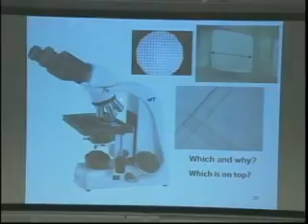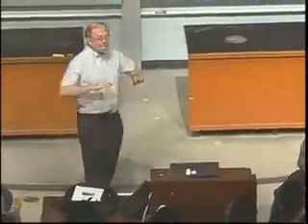What you can't change is the focal point of those lenses. The focal point of those lenses is fixed because this lens is always going to be that length from there, right? So the focal point of the lenses is always fixed. So how do you focus specimens? The way you focus specimens is you move the stage up and down. And this is a very difficult concept.